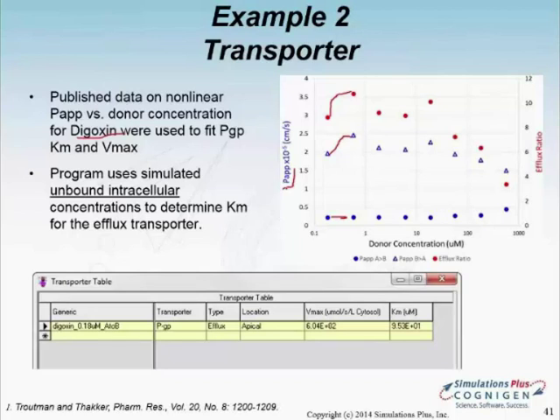Okay, so we had one slide where I was showing the paracellular permeability, and you would see that we actually account for different apical versus basolateral porosity, just because of the shape of the pores, and the openings are a little bit bigger on one side than the other. So that might account for this specific aspect of the mannitol. But I'm not sure if we have looked, if we had the data to look at it in any close detail to see how it's accounting for that kind of difference.